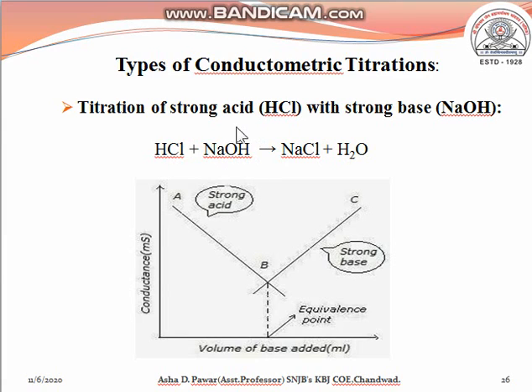Then in the burette we fill, suppose, NaOH of known concentration.